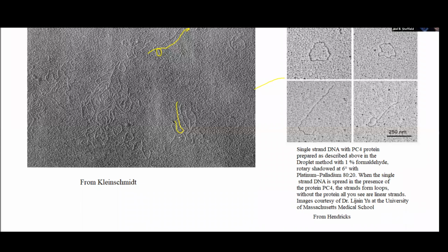That's what Kleinschmidt did. What he showed was that he could actually take a population of DNA fragments of some sort and show that he could trace them and figure out their lengths and see what kinds of relationships he was getting among the lengths. And what he actually claimed was that he was getting things that fit a kind of sequence that went almost like a Fibonacci: 1, 2, 4, 8.